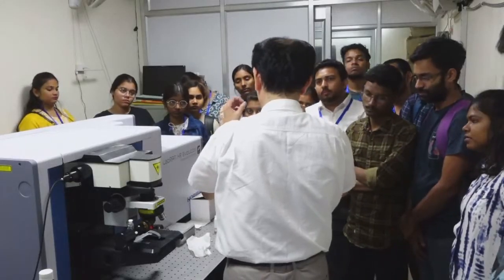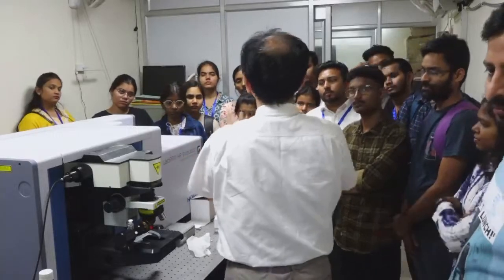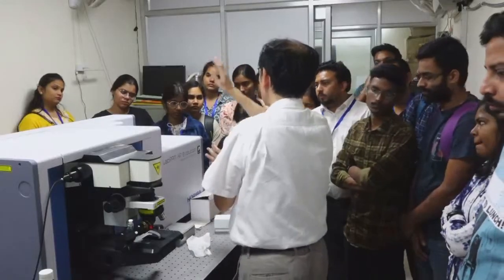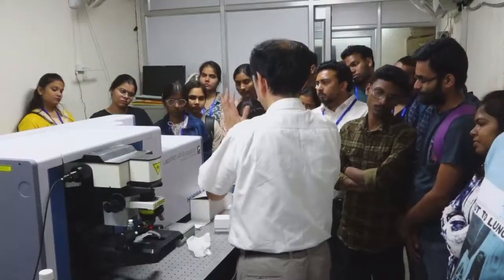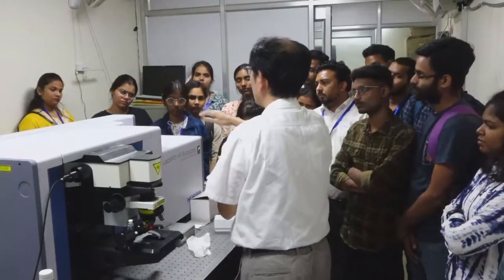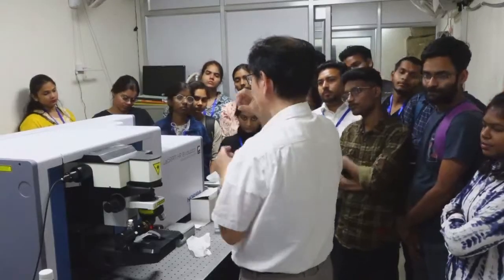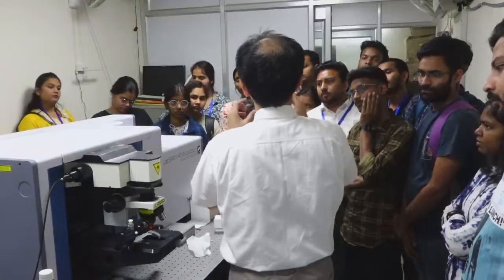But anyway, it's high enough to convert photon information to electron information. Then accumulated charge is counted and transferred to the PC, and it appears as an intensity at each wavelength. This is the spectrum.